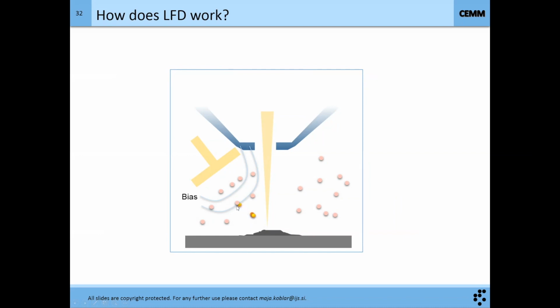This electron ionizes again and again, and you get more and more electrons coming to your detector. Those electrons are then acquired, and you see your topographical image. But you also have positive ions, because they lost electrons, and those are attracted to your surface because you have negative charge accumulation there. They take your electrons, and you don't see the charging anymore.